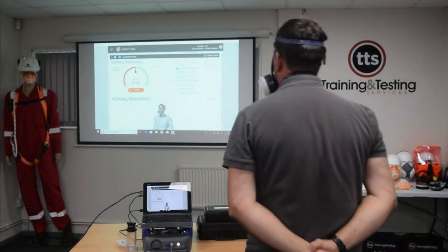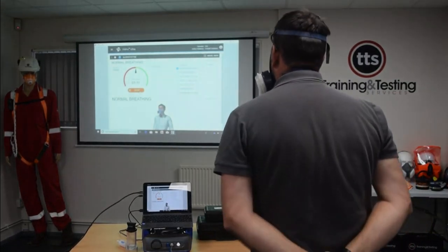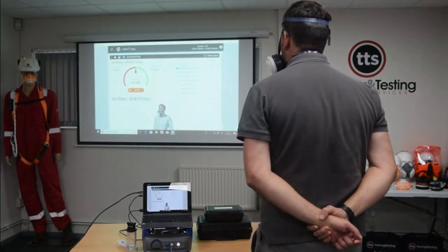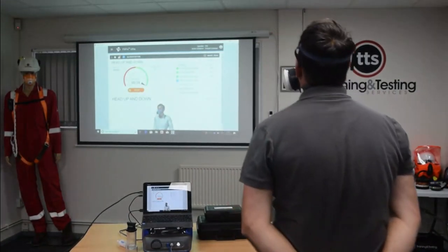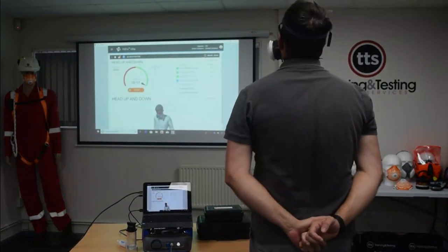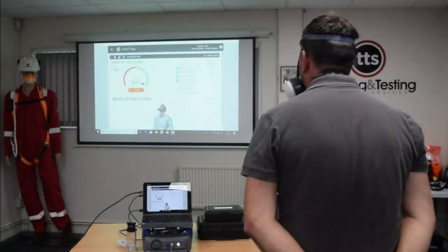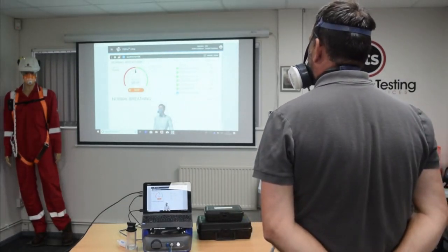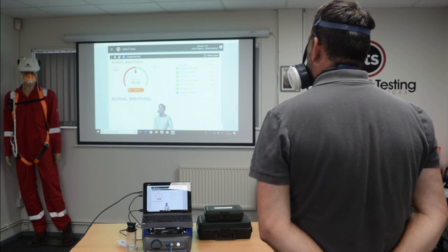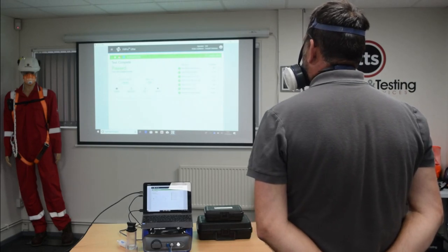Okay, so the first exercise, just as before, is normal breathing and stepping up and down on the spot. Wait for the machine to finish off its calculations, and that's the test complete. And again, we can clearly see that's a good pass.